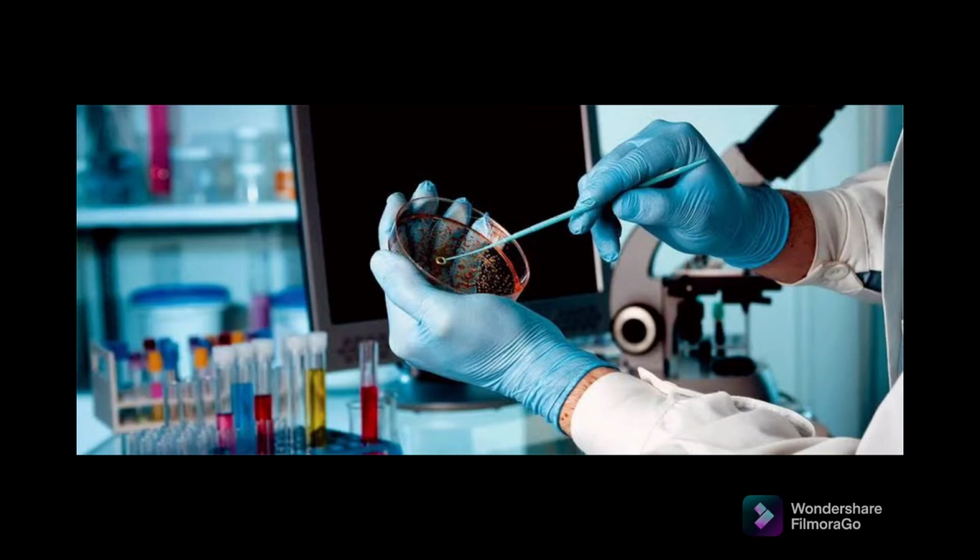Of the 4 types of pigments, only the pyocyanin is important from the diagnostic point of view, as pyocyanin is the only pigment that is not produced by any other species of Pseudomonas but only by Pseudomonas aeruginosa, imparting a characteristic color to the medium.